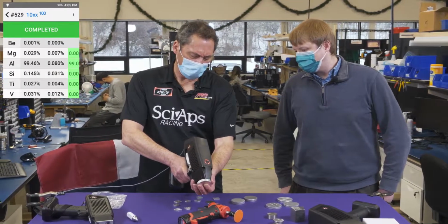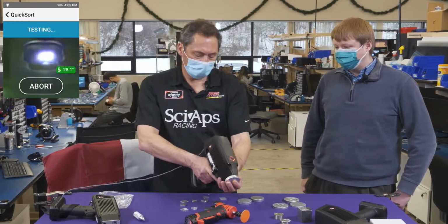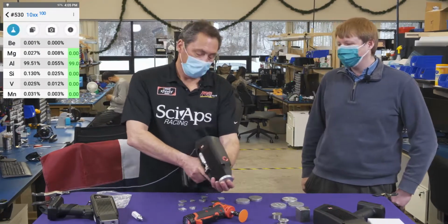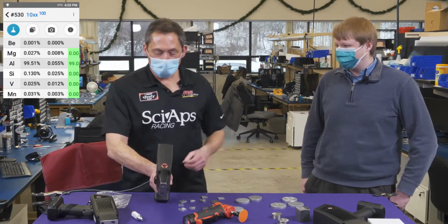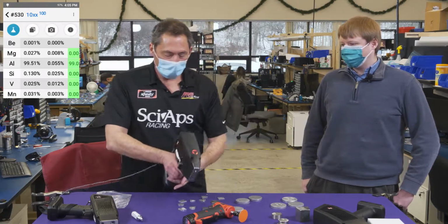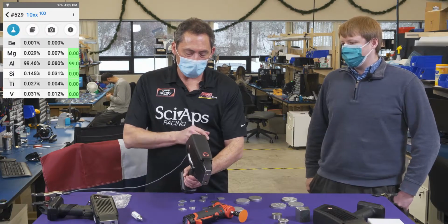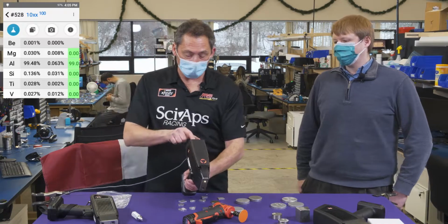Same number on the mag, huh? Mm-hmm. Very good on the repeatability. Good precision. Oh, you messed that one up. It came in at 027. All right. No pitch check for you guys this week. Oh, we're sorry. But let's look at some of the others. So that was a low magnesium. But you see, even in air, 027, 029, 030. Great repeatability on low magnesium.